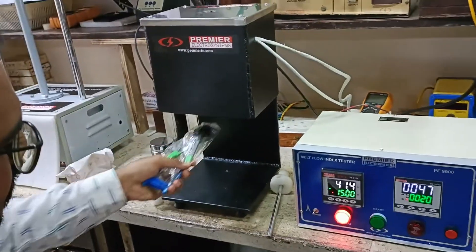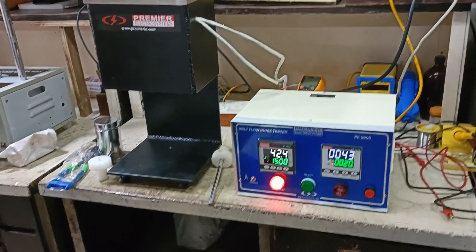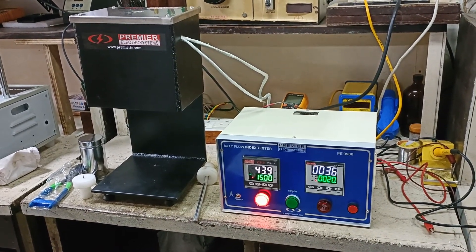Using this cutter we can cut the material and weigh it in the weighing scale provided. With all the values you can just enter it into the excel sheet provided and you will get the MFI value of your material.